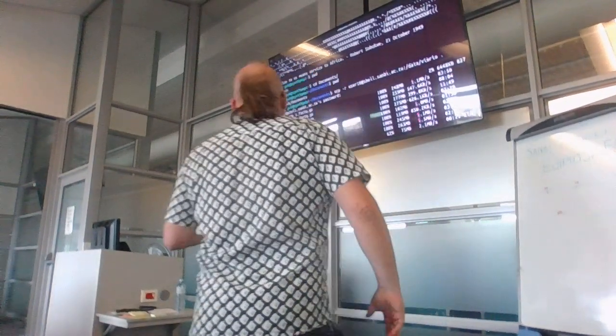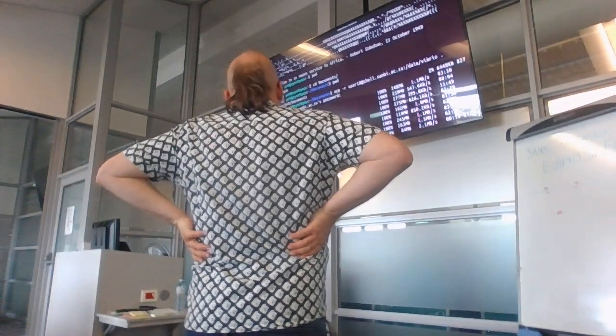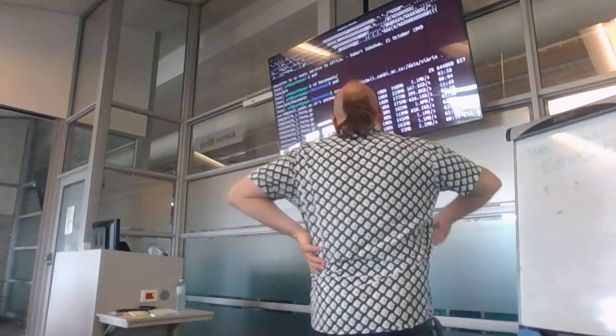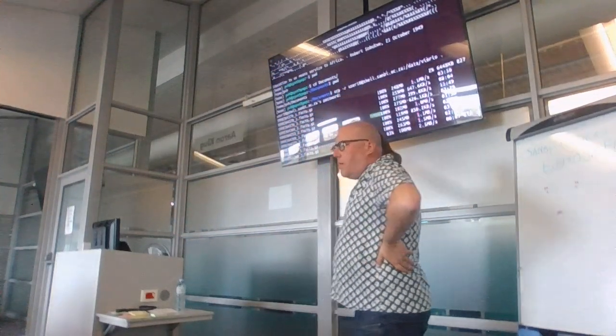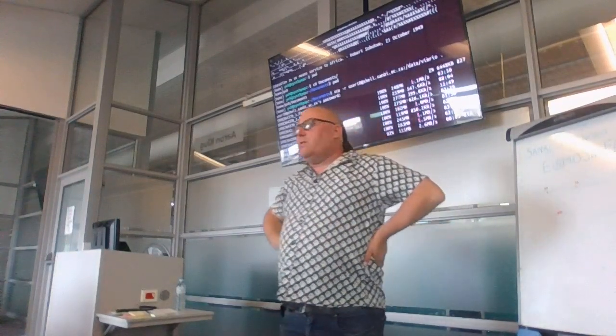There's 5 samples here. I have 1, 2, 3, 4, 5, 6, 7, 8, 9, 10. I'm busy with the last. You should get 10 FASTQ files downloaded. Okay, you should have 10 FASTQ files downloaded. Has anybody got all of them yet? Mine isn't complete yet.